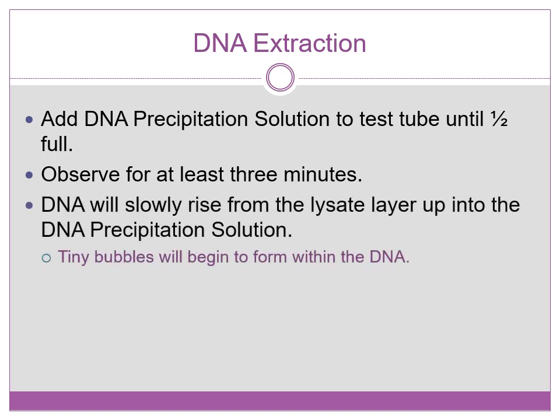Once 3 minutes has elapsed, at the top of the solution, you might see something that looks thick and viscous compared to the rest of the solution. This is what we call the DNA. The DNA is usually thick, and we usually remove it with some kind of wood stick or toothpick. You will also see tiny bubbles begin to form within the DNA.